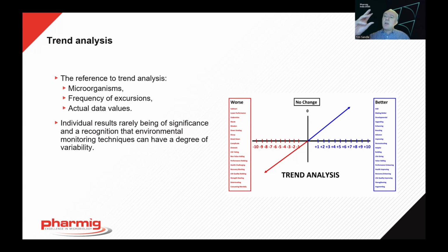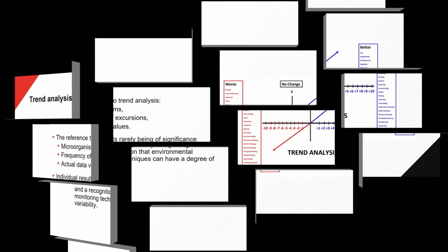It's kind of the big shifts that we want to be focusing on. But it's useful to get an understanding of what types of excursions, what types of patterns we want to be most concerned with, and how we are going to follow that up. Not let things drift too far that they become a fundamental problem.